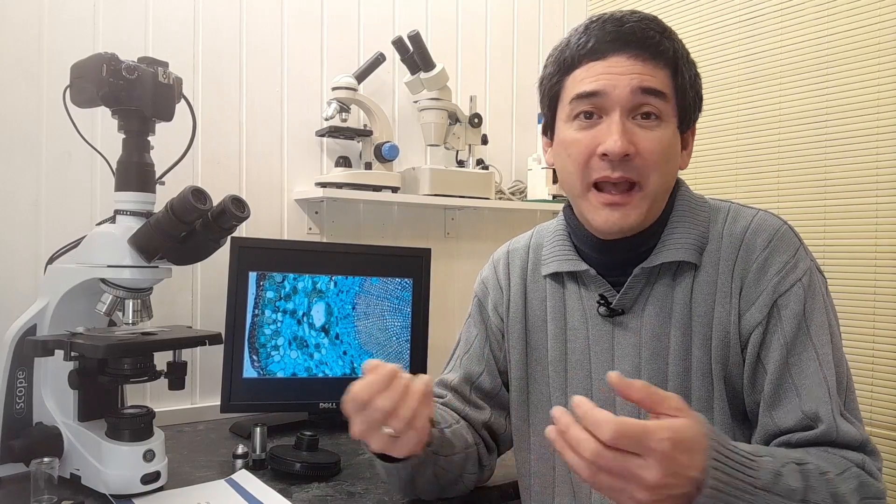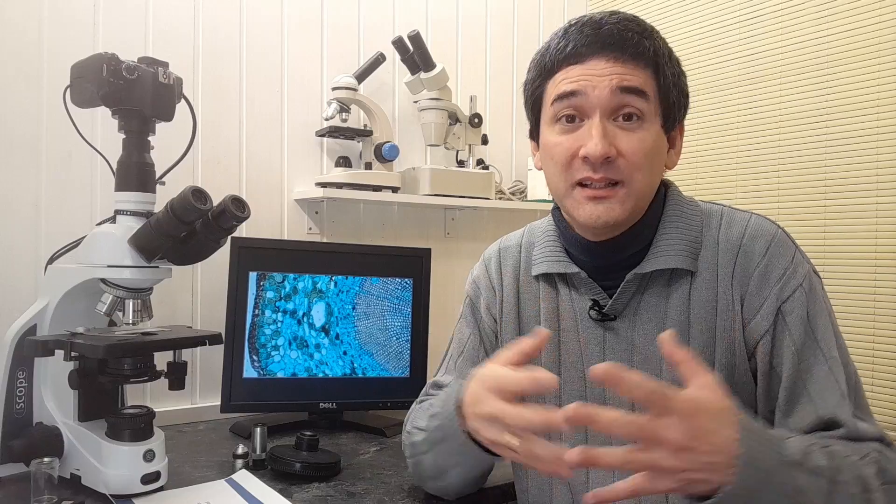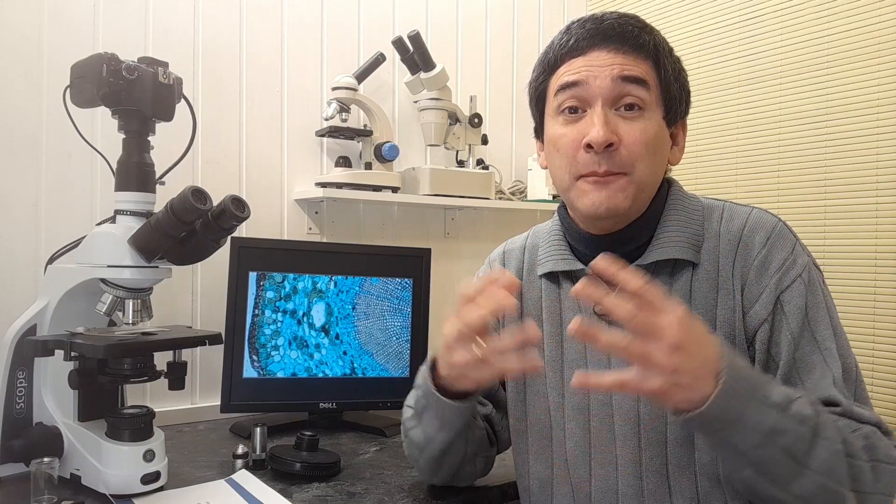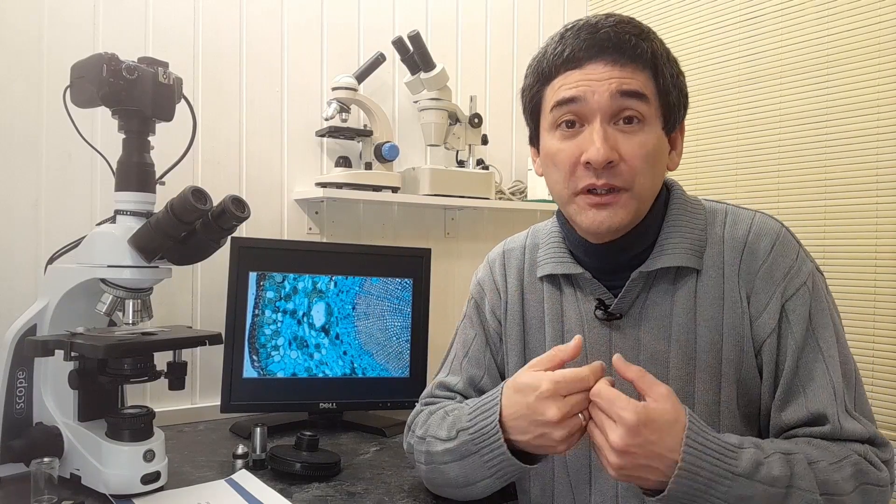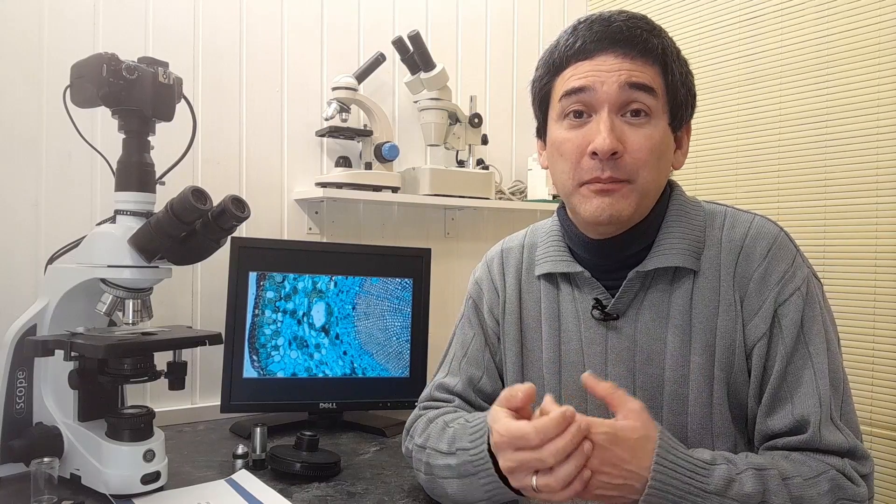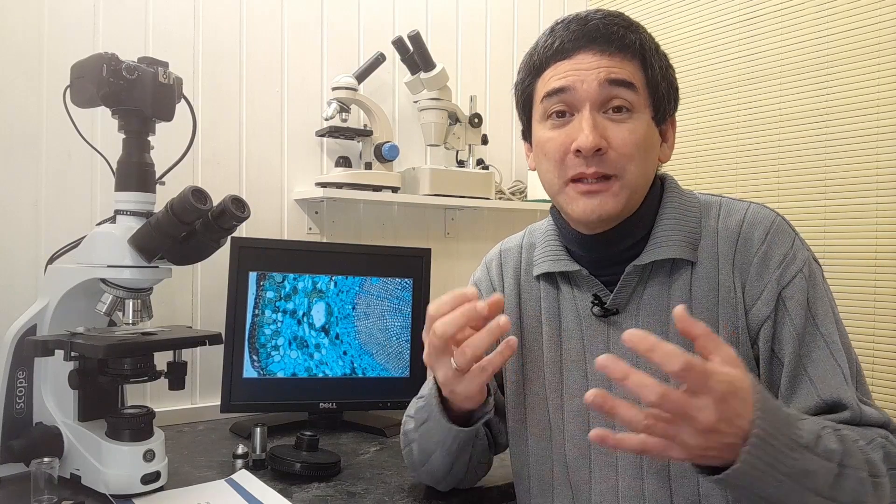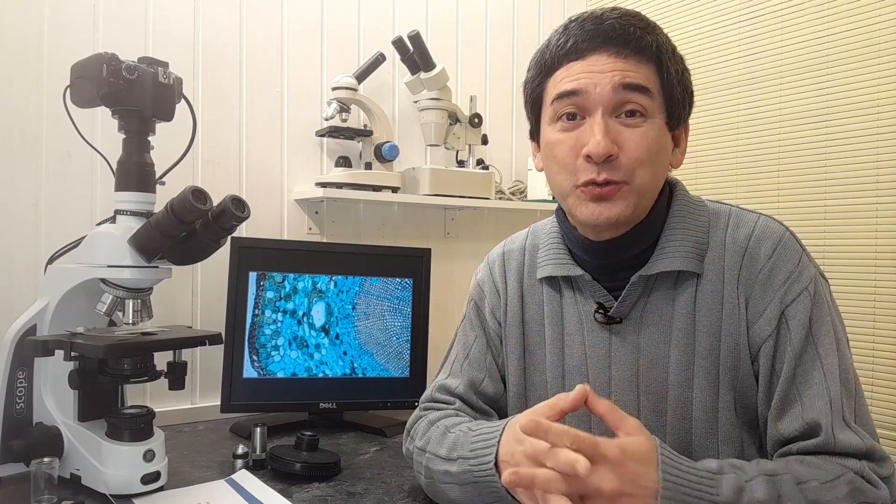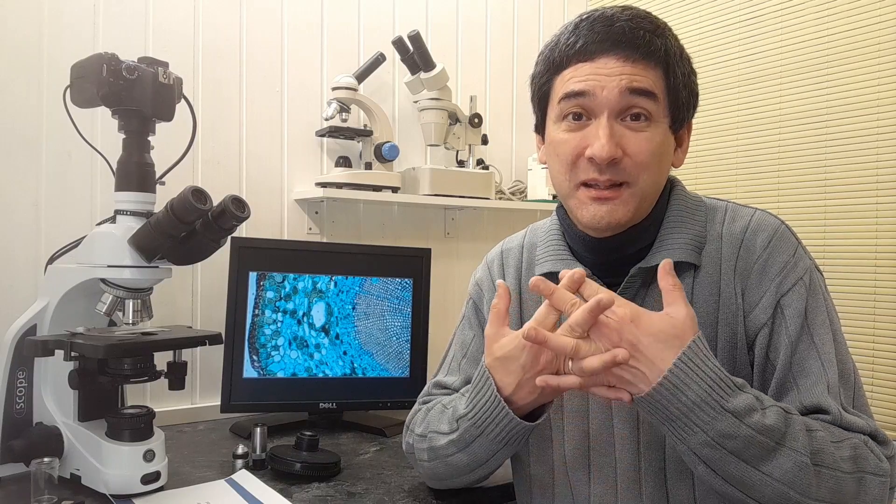Chemical staining by adding a pigment, for example methylene blue, safranin solution, whatever, these chemicals generally also kill off the cells because these are chemicals that react with the parts of the cells. And if you want to observe live organisms under the microscope, then it can be a little bit difficult because sometimes they're very difficult to see. But phase contrast microscopy makes this possible.